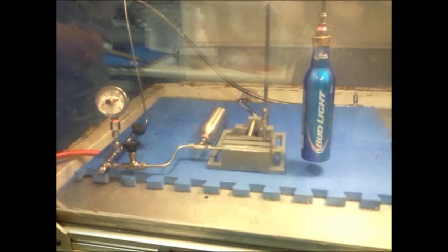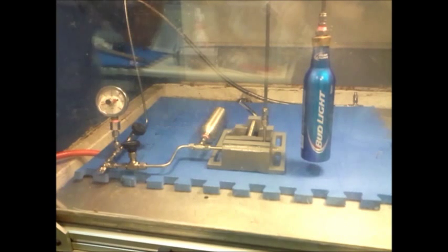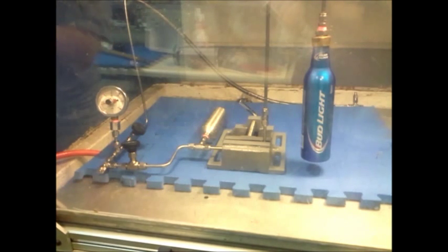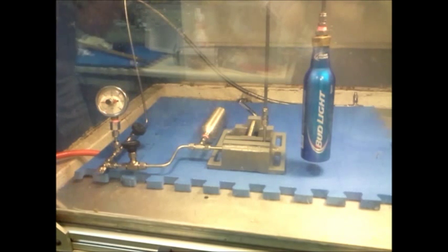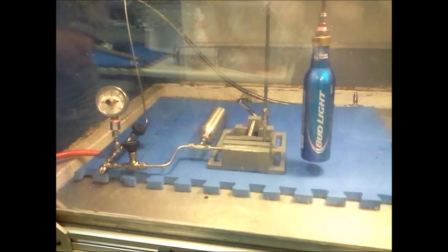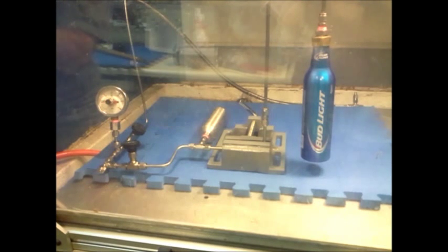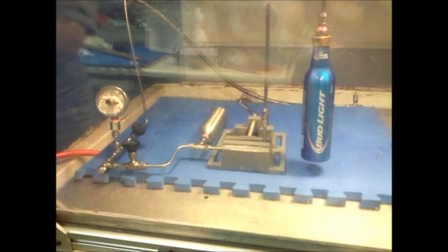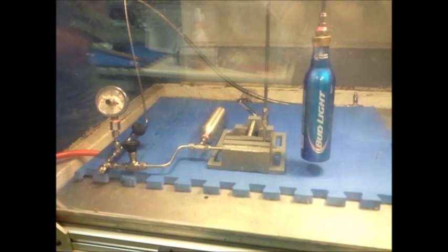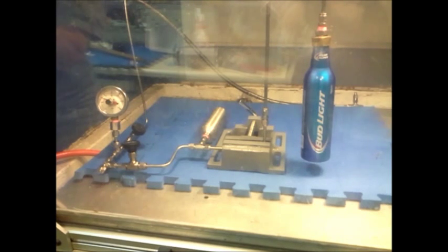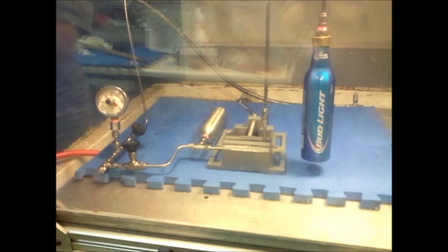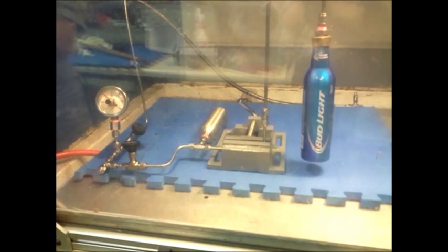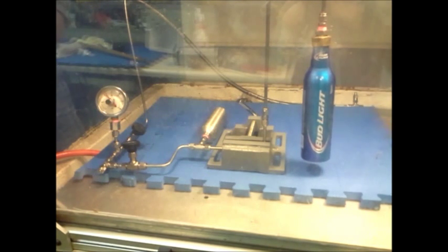We're pressurizing the system, 50, 25, 50, 75, 100, and you can see what's beginning to happen.